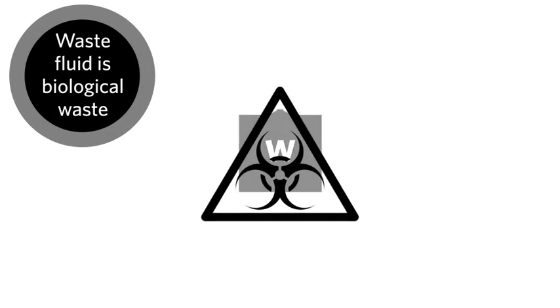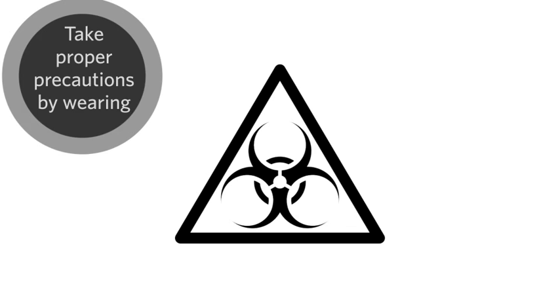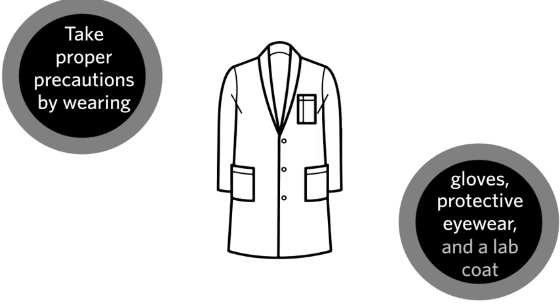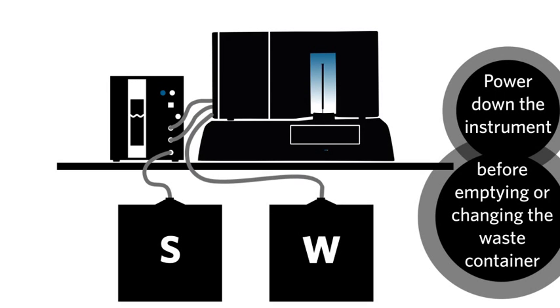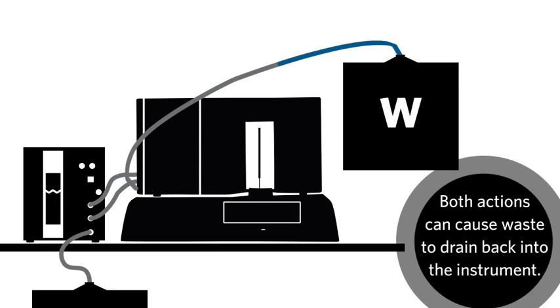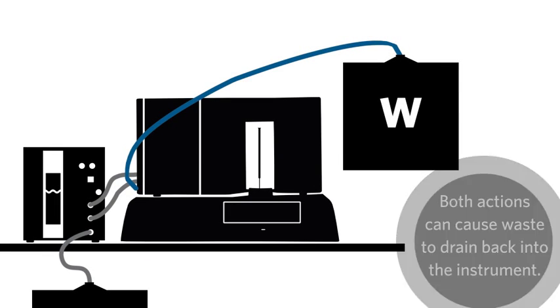The waste fluid is biological waste. Please use proper precautions by always wearing gloves, protective eyewear, and a lab coat. Make sure the instrument is not running while emptying or changing the waste container, or lifting the container above the instrument. Both of these actions can cause pressure issues or push waste back into the instrument.